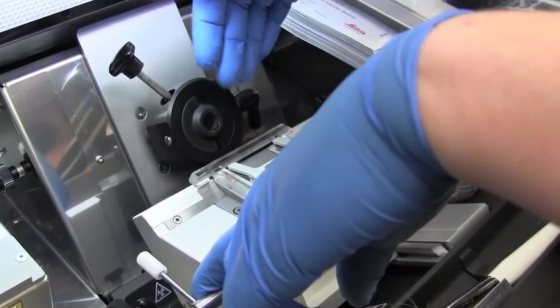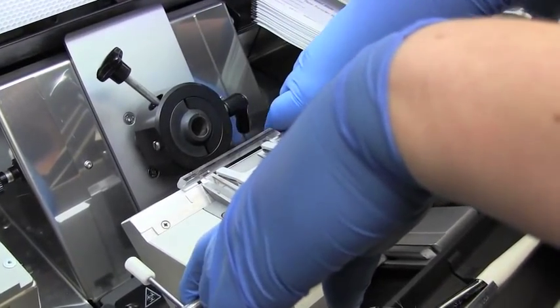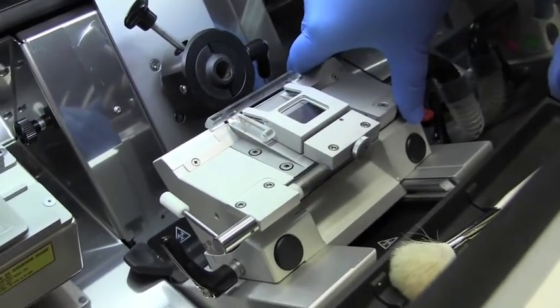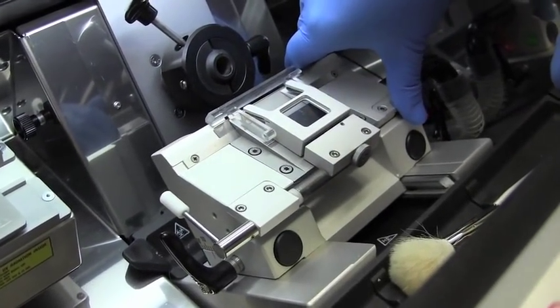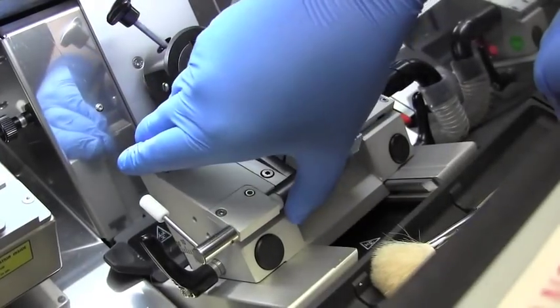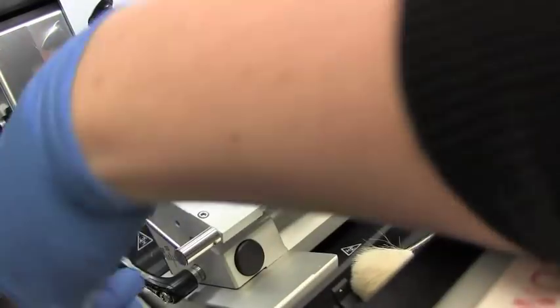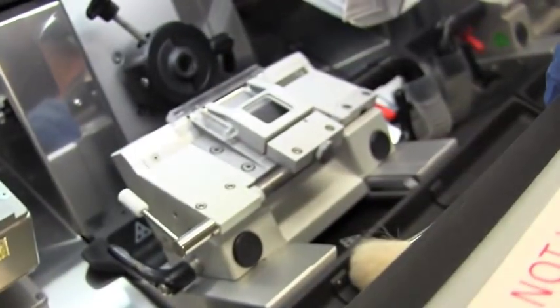So the angle at which the blade strikes the sample is important to making a clean cut. So we like to have it around 10. You can just turn it and set it like that. And then clamp down with this black bar.